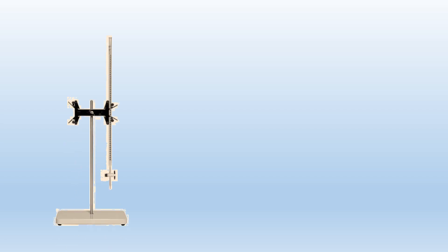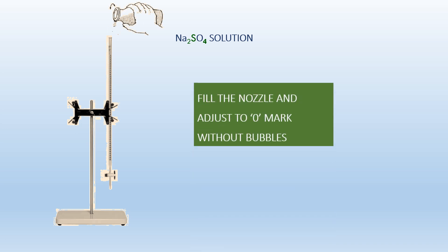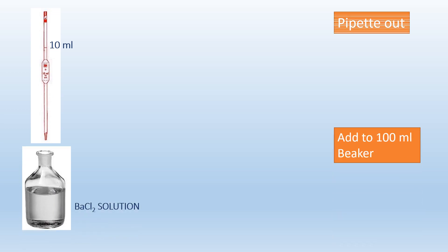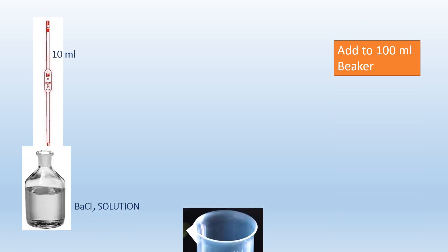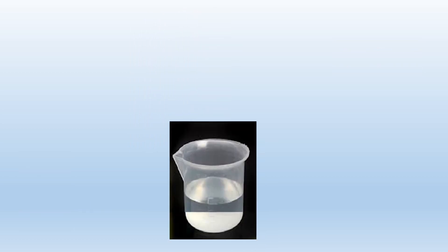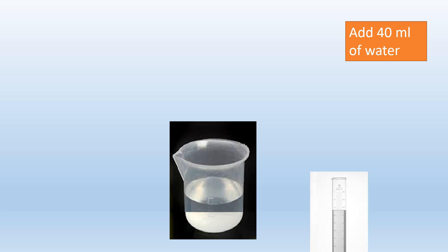Now let us start the experiment. Fill the burette with sodium sulphate solution. Take care that the nozzle is filled, there is no bubble, and you have adjusted to the zero mark. Pipette out 10 ml of barium chloride solution and add it to a beaker, then add 40 ml of water.